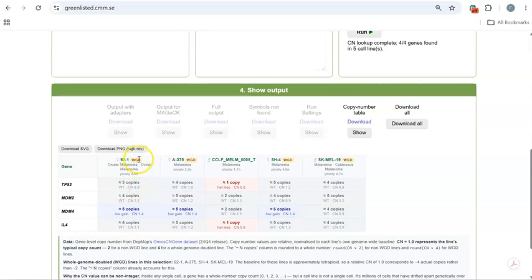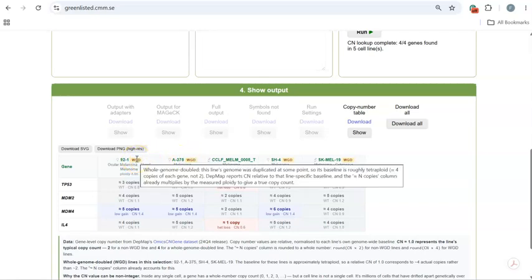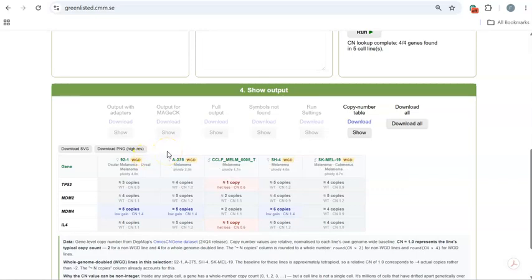You will also see that many cancer cells, almost 50% of cancer cell lines at least, have this whole genome duplication or doubled, meaning that they actually have double the amount of copies. And what you see then down here is sort of an estimate of how many copies these cells have based on if there's whole genome duplication as well as the copy number variation. So if it's gray, it means that it's sort of normal, there's no copy number variation, except for that there might be duplication to start with.